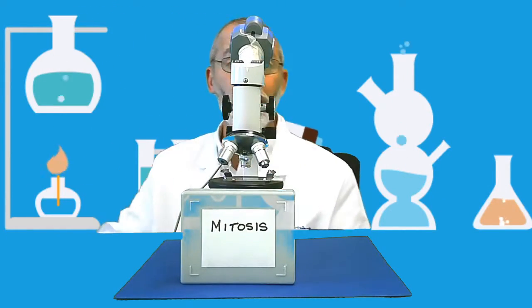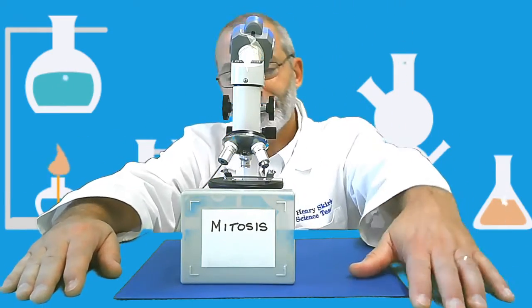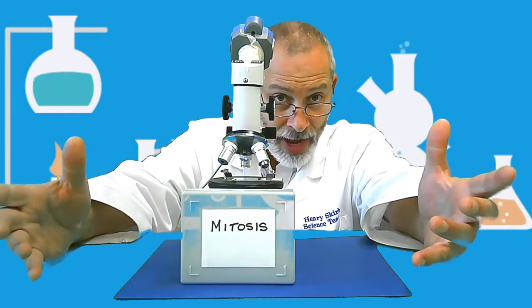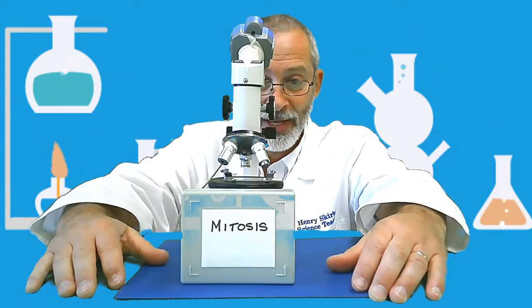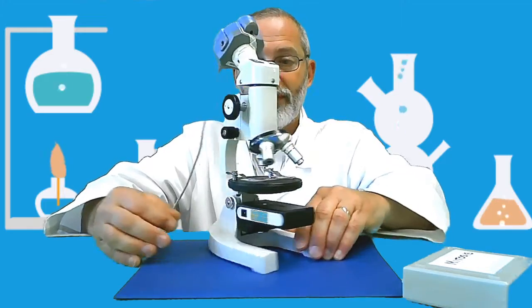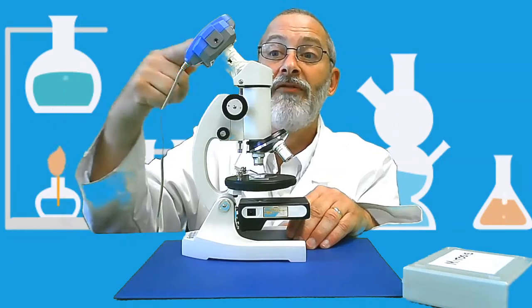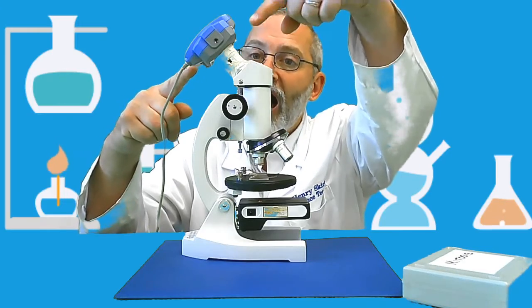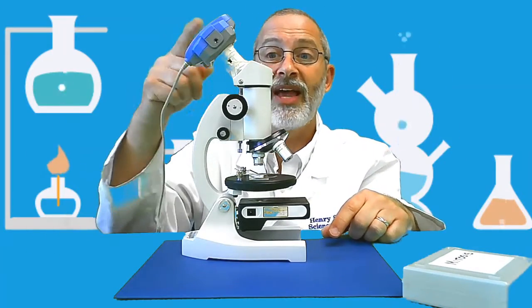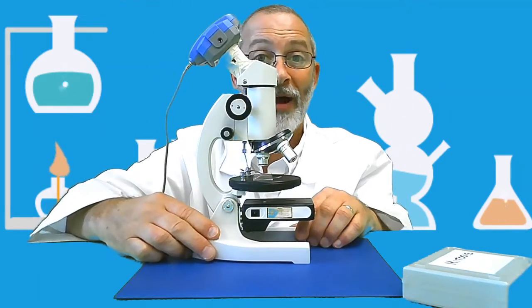Well, I'm going to be quizzing you here in a little while with our lab activity, but before we do, I'd like to take you over to our virtual lab here, because I have something set up for us all. Since we're not sharing our microscopes right now, I'm going to share my microscope with everybody. And first, take notice of what I've done to my microscope. I have attached a digital camera in place of what's normally here. And what's normally at the top, everybody? The eyepiece lens. So instead of the eyepiece lens, I removed it and I kind of taped on a digital camera here on the top of our microscope.